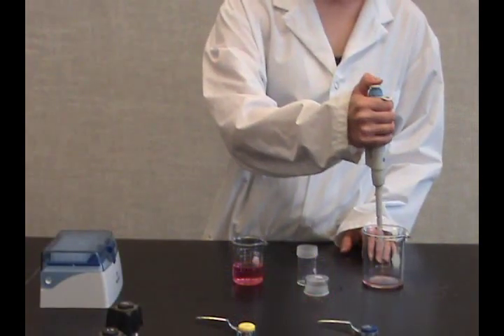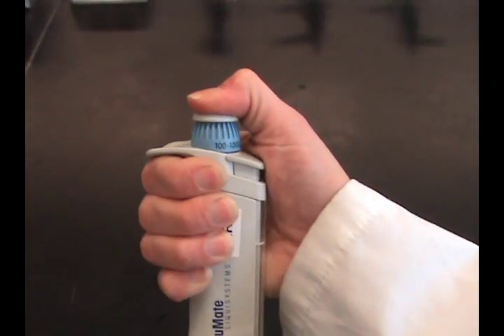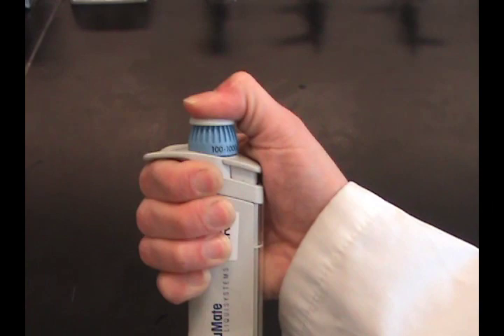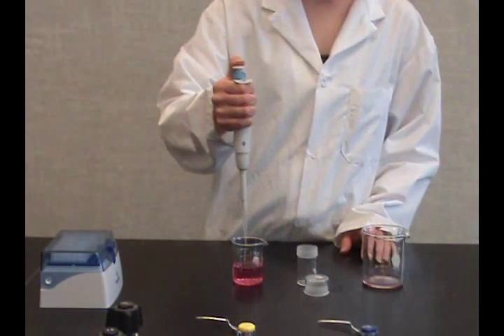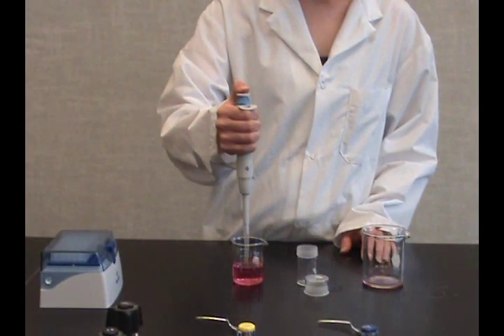Dispense the sample into a waste beaker by depressing the plunger to the first stop and then slowly press it down to the second stop. Withdraw the pipette, keeping the plunger fully depressed.